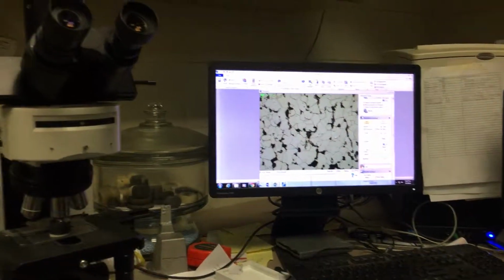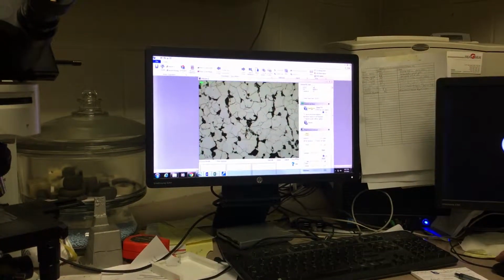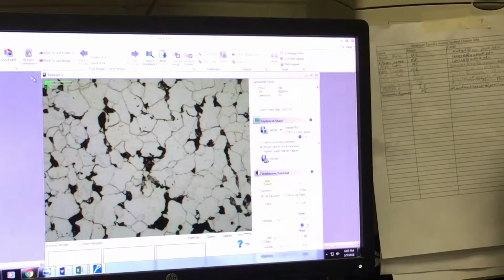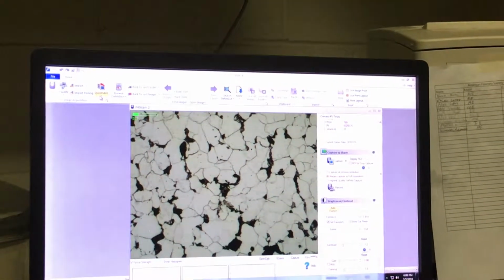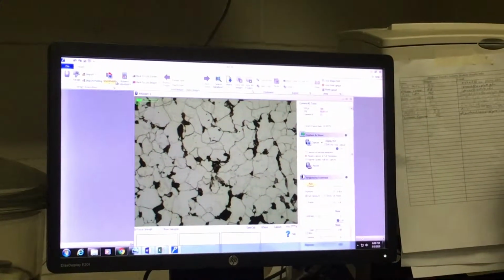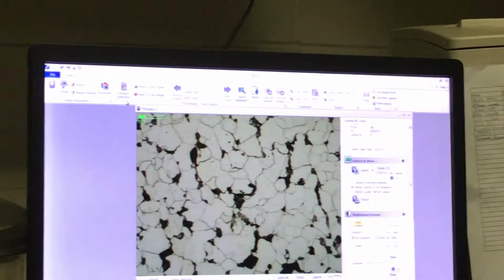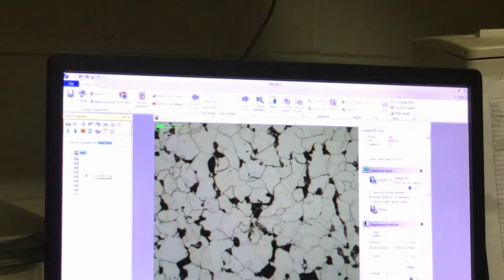Okay, so now we want to record this. When I say record, I mean capture the picture, not record a video. The thing is, this program's really picky on where you put your files. So I'll show you, there's two places you can go to look at file structure. One is this browse collection, which basically shows us what's on the hard drive. And here are your files.